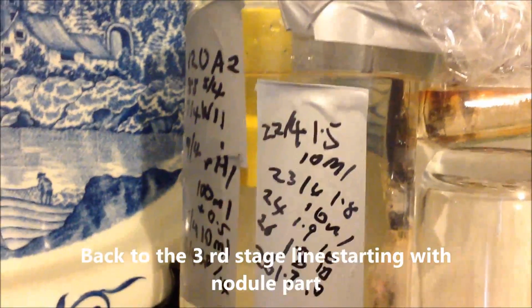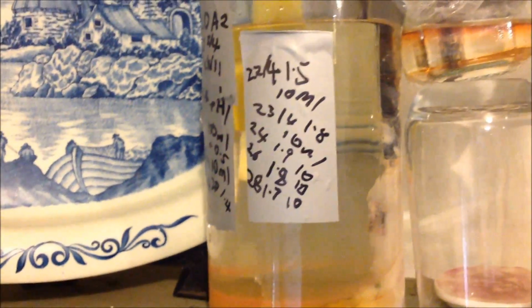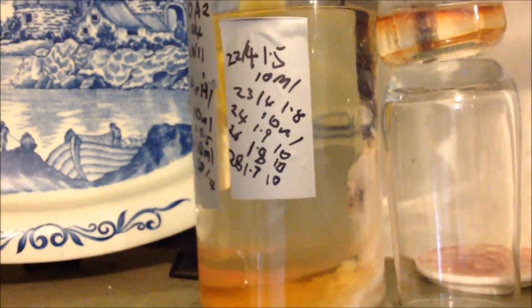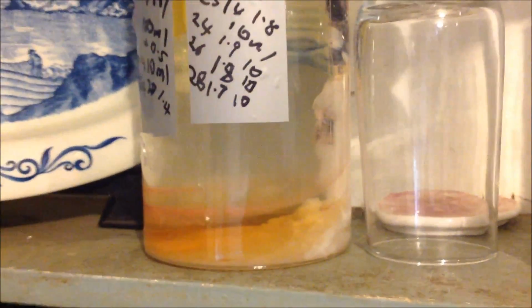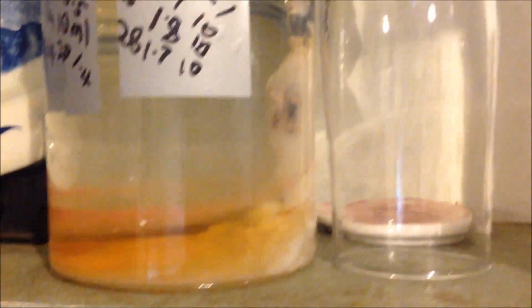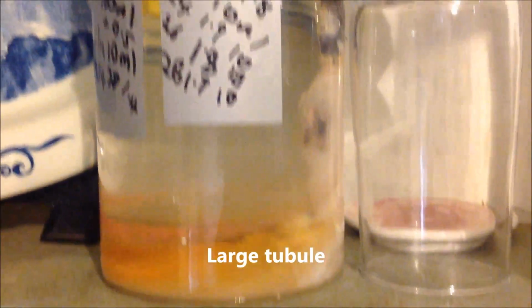120A2, some of the noduled harder precipitate redissolved. You can see there's a column down from the wick to the base. The pH is still struggling to come up. See, it's there flashing 1.2, still some ways to go.